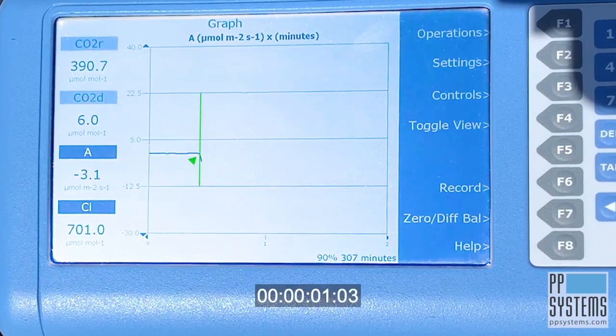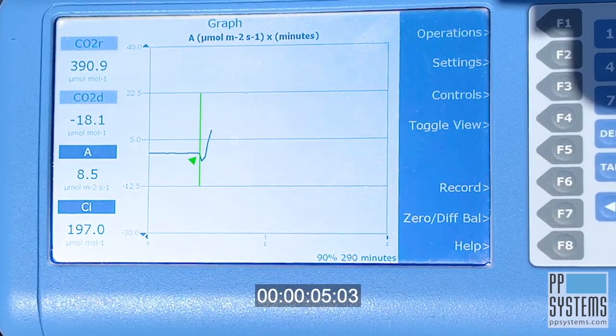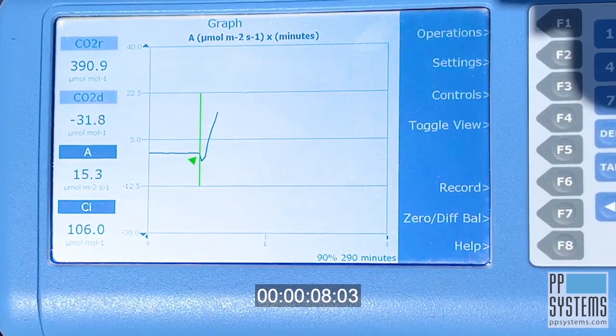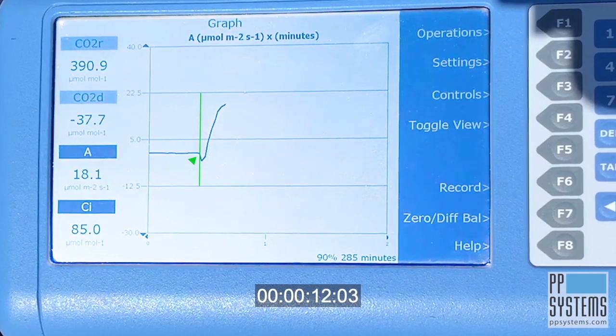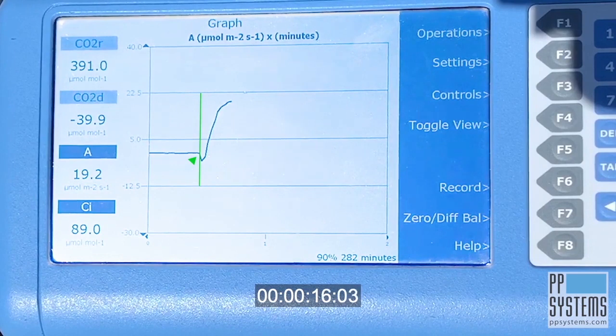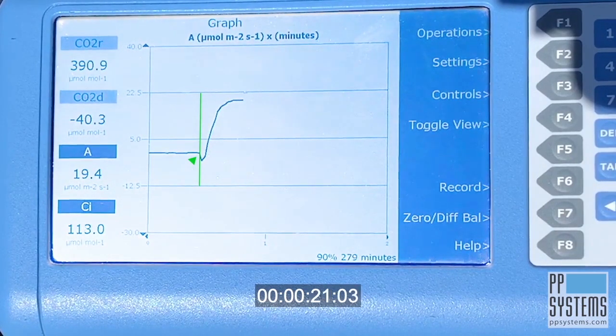Notice the arrow marking the placement of the leaf into the cuvette. In this actual photosynthesis measurement using a geranium leaf, watch how quickly stability can be achieved. This allows you to make multiple highly accurate measurements in just minutes. Collecting more data in less time enriches your research experience and expands the possibilities.